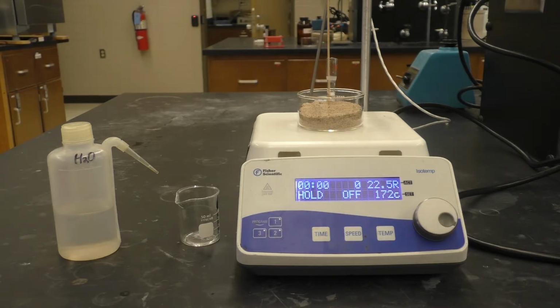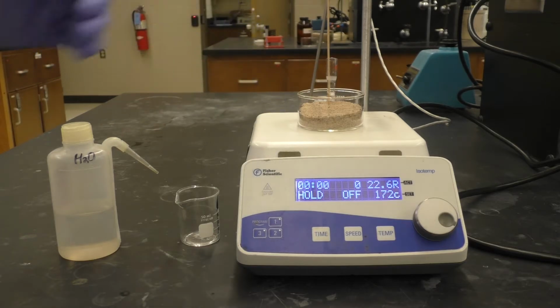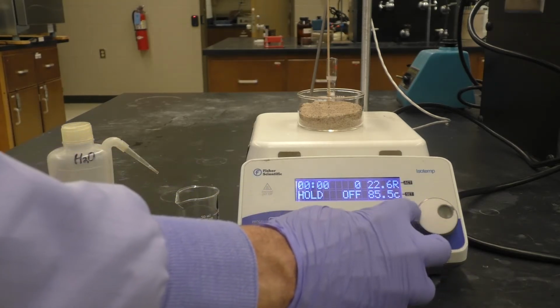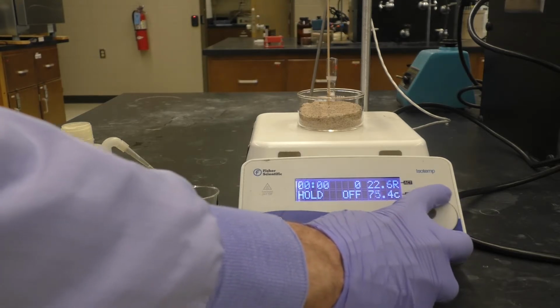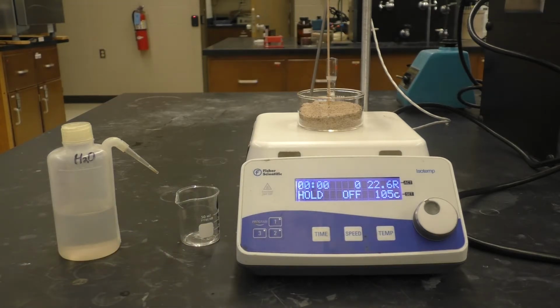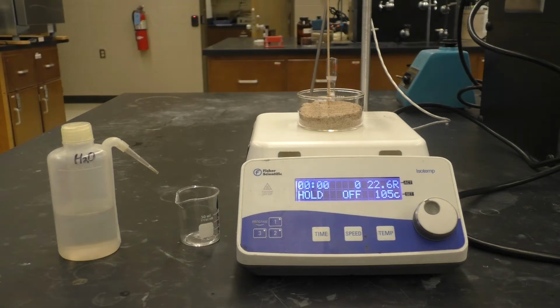Here I have a thermocouple that will tell the hot plate to raise the temperature to the desired temperature. So here I'm going to adjust this down to close to the boiling point of water. Now my material may dissolve before the water begins to boil, and hopefully that will be good. I simply want to monitor it. I'll be able to pull it out every once in a while, stir it with the boiling stick, and pay attention for when all of that material dissolves.